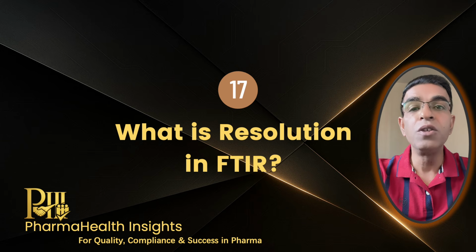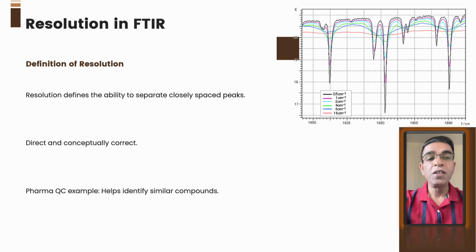So now the interviewer will check your knowledge on the method parameters. So the next question may be, what is resolution in FTIR? And you can answer this in a simple and confident way. Sir, resolution in FTIR refers to how clearly the instrument can separate two peaks that are very close to each other. So basically it tells us how well two closely located absorptions can be distinguished in the spectrum.